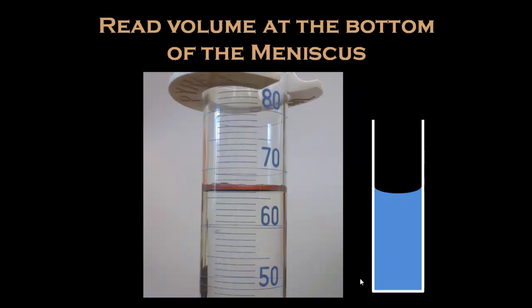Next, look carefully at the liquid in the container. You'll notice that water and many other chemicals tend to cling to the side of the container. The property of surface tension causes the water to cling to the side of the container.